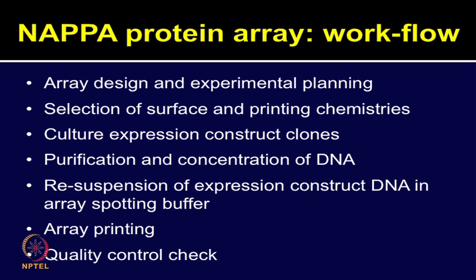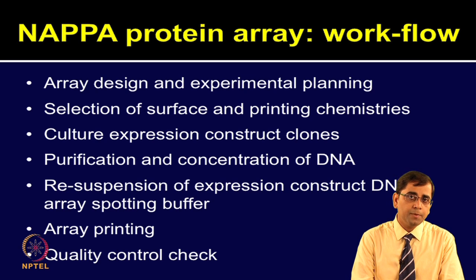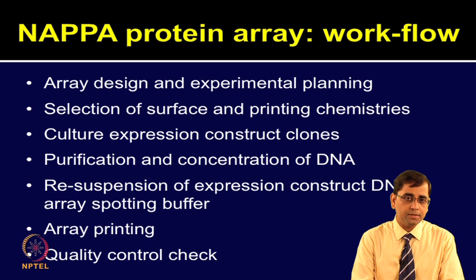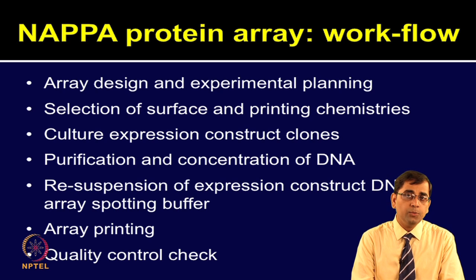Once you have done the culturing of clones, now you need to concentrate on DNA preparation. Almost all the molecular biology laboratories perform these experiments on a routine basis, and DNA extraction is very straightforward to do. However, when we talk about doing the experiments in high throughput, it poses several challenges, because the quality of all your features has to be good. So, various types of quality controls and various observations one needs to keep in mind for even simple experiments like DNA purification and concentration.